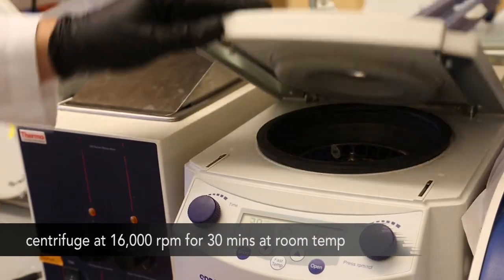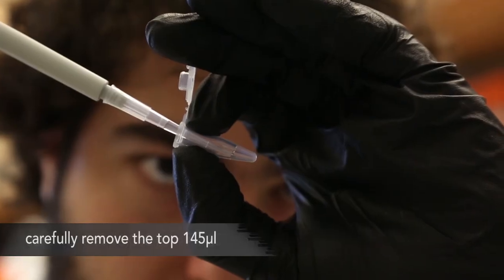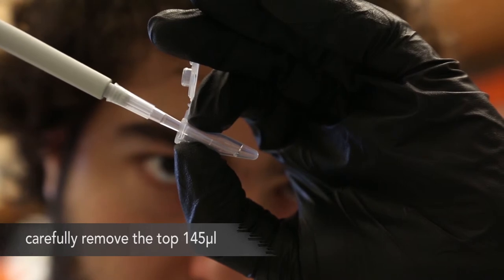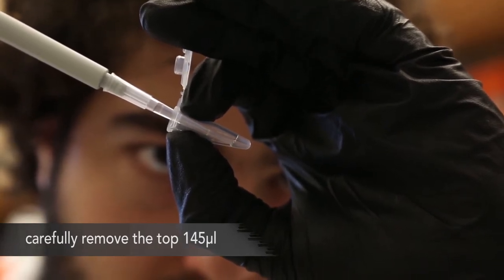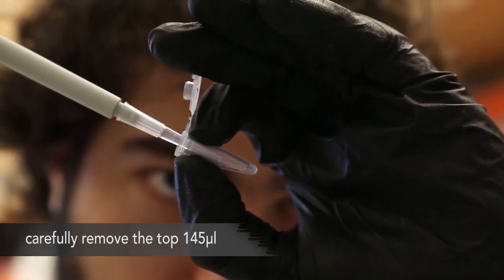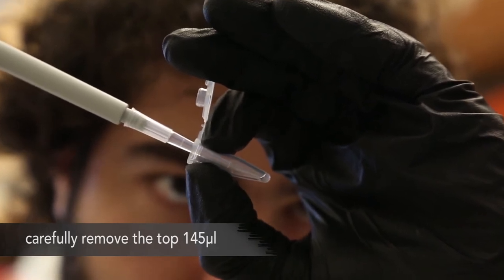Centrifuge at 16,000 RPM for 30 minutes at room temperature. Then carefully remove the top 145 microliters. This should be done very carefully, as it is easy to disturb the pellet. It should take roughly 30 seconds to slowly pipette out the supernatant in one smooth draw. It helps to constantly be pipetting near the fluid-air boundary, so as to be as far away from the pellet as possible.